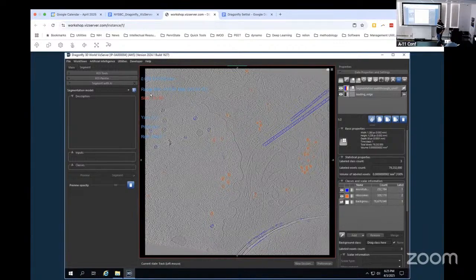But say you wanted to make this work better. You don't want it to find these little vesicles out here, because that's all false positives.